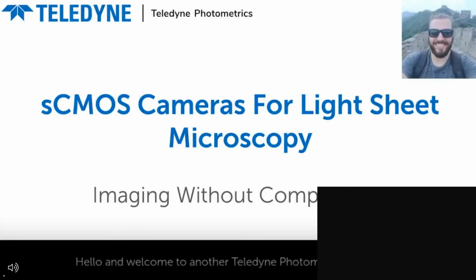And welcome to another Teledyne Photometrics webinar. This webinar is going to be all about light sheet microscopy, the benefits, the challenges, and how such a variable application as light sheet microscopy can have all its needs met by modern CMOS camera technologies.